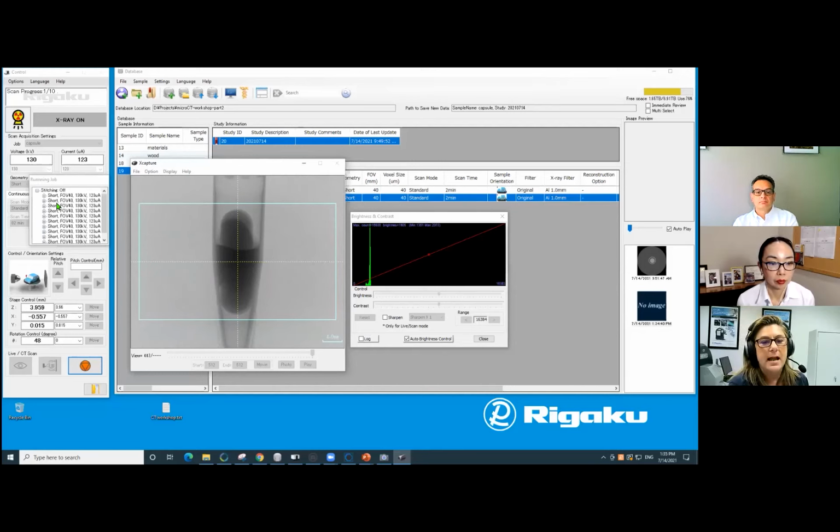So that I wouldn't have to add that extra scan. So we're just going to wait and see what happens. And while we're doing that, we have plenty of time for questions in case you have some.